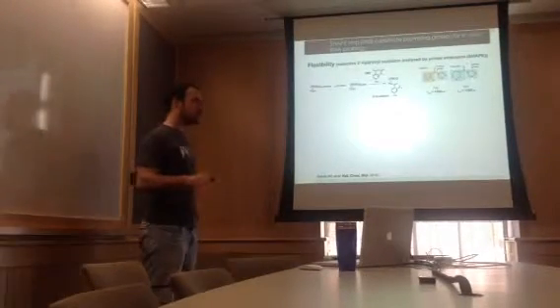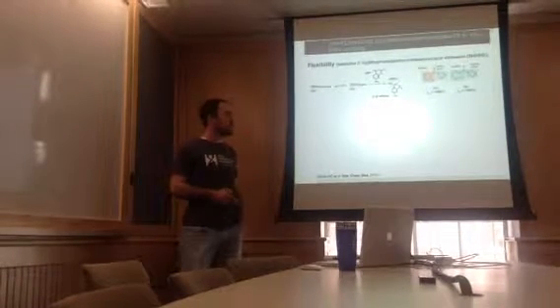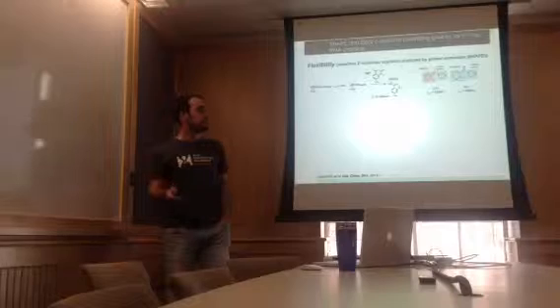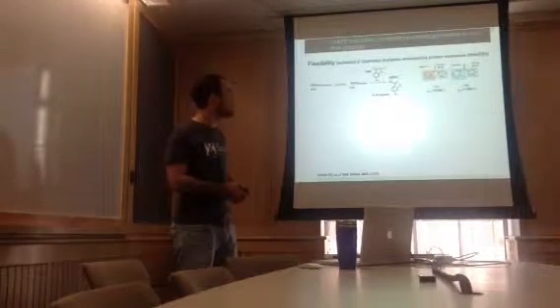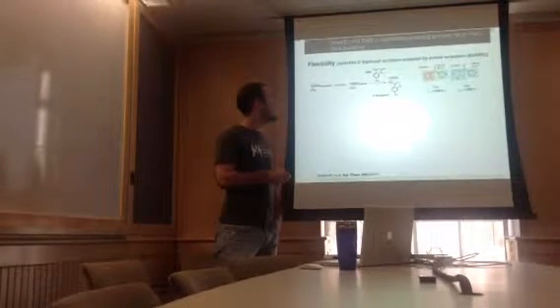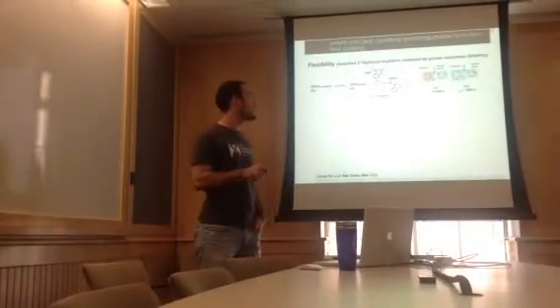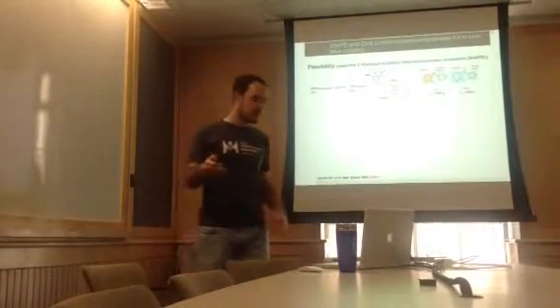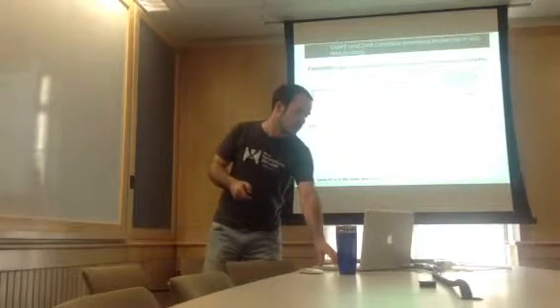And why SHAPE hasn't been used, prior to recently, for the probing of RNA structure in vivo is because it has too short a half-life, from a few seconds to a few minutes. But a new generation of SHAPE reagents has been reported recently with longer half-life, and they are cell permeable, and it allows us to modify RNA structure in vivo.